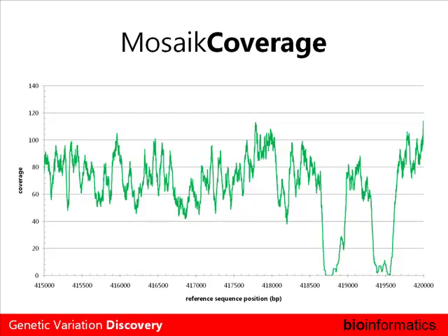This to me is actually far more desirable than the opposite effect. Some aligners aren't very tolerant to repetitive elements, and you'll see huge peaks when you have something repetitive, and that's just going to throw everything out the door when you're trying to do SNP discovery or indel discovery. I see that both behaviors are not really desirable. That's true, but you can use that mode where you say align everywhere possible.